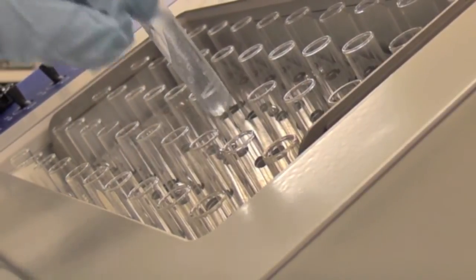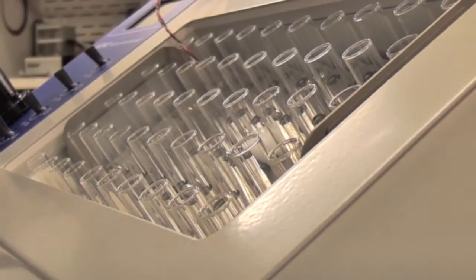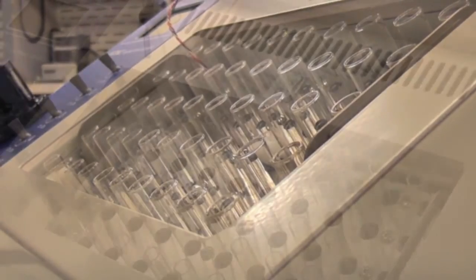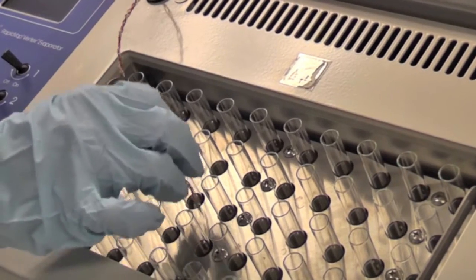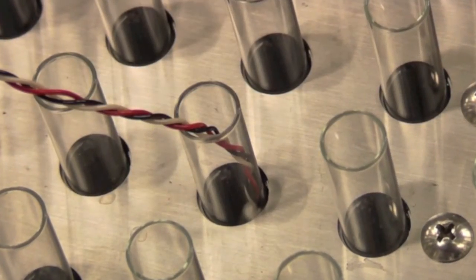By angling the glassware, surface area is increased to maximize evaporation. A temperature sensor monitors the block temperature or the sample temperature, preventing overheating of samples.